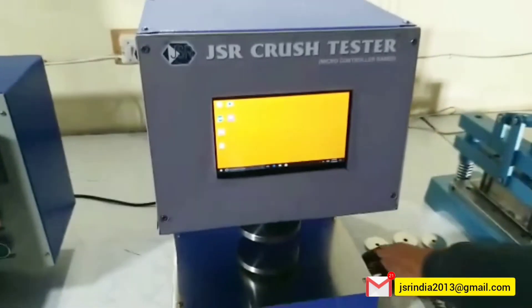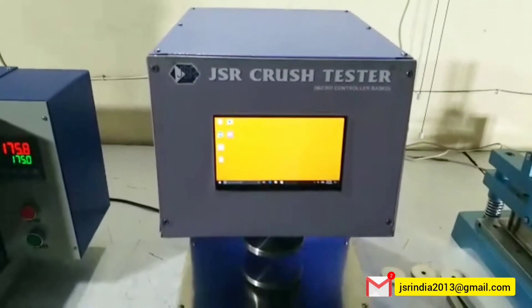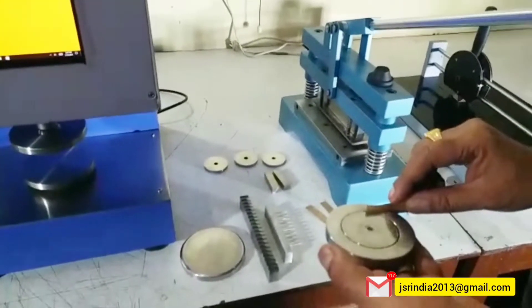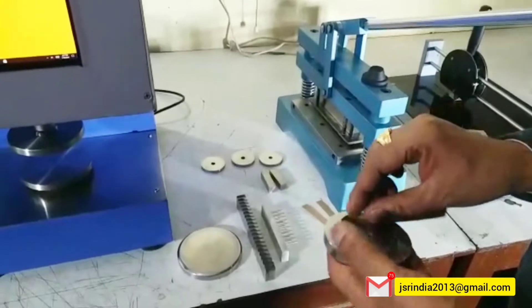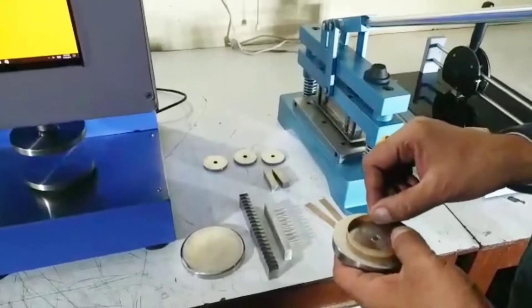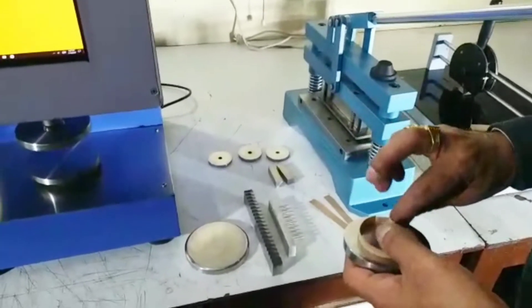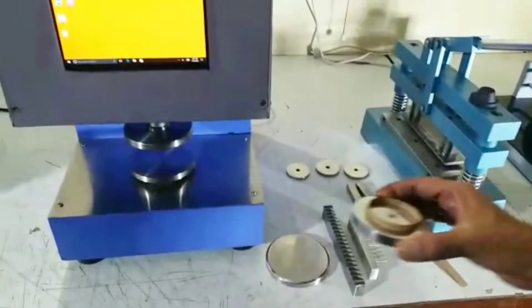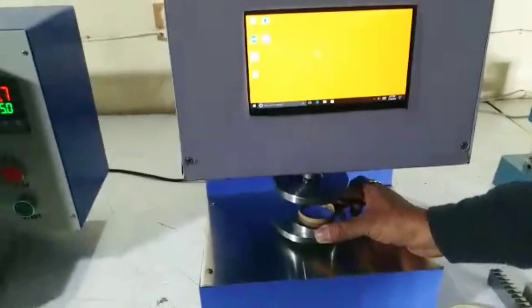This is the machine front panel. There is a computer inside the machine. First, we are making the sample. This is the processor by which you can make a ring, using this disk. This disk is a spare which can be provided along with the machine.